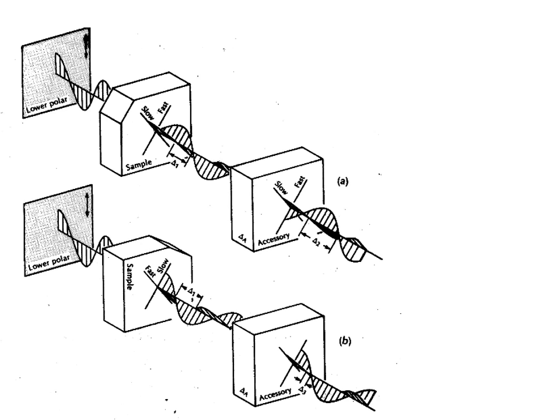And it contains a mounted mineral grain of known thickness and orientation, so it produces a known amount of retardation and in a known direction. Typically, this is either a crystal of quartz or a crystal of gypsum, and it is made so that it will show exactly one order of interference color, so 540 nanometer retardation, so that when you insert it, it turns the field of view bright pink, first order pink.